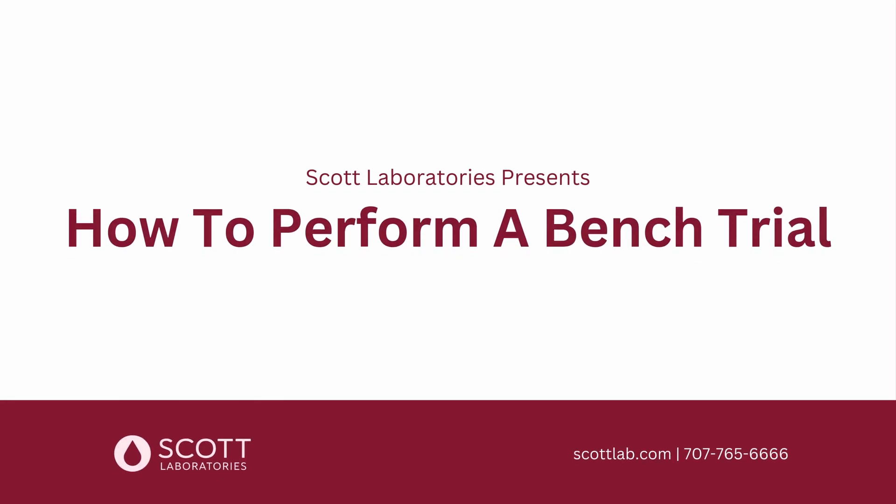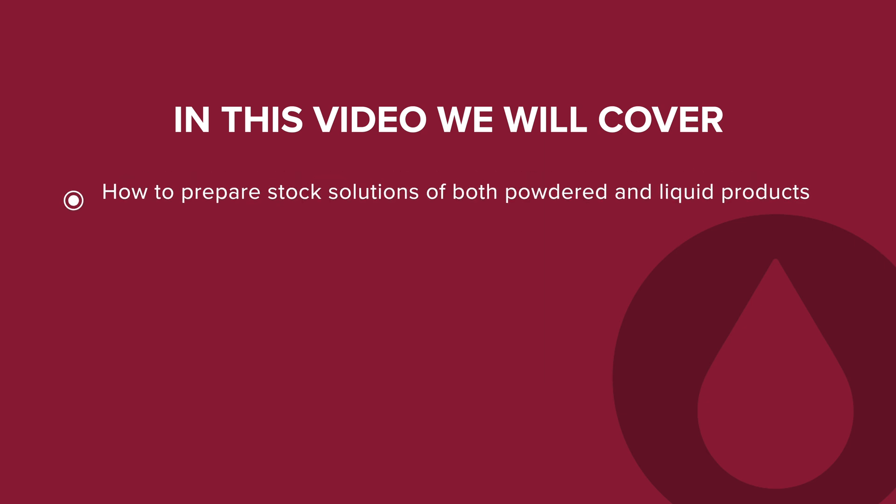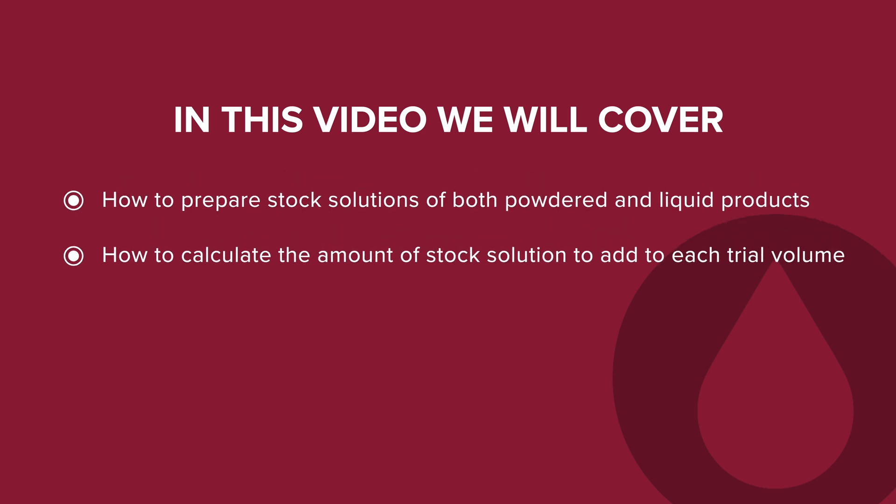How to perform a bench trial with Scott Laboratories. In this video, we will cover how to prepare stock solutions of both powdered and liquid products, how to calculate the amount of stock solution to add to each trial volume, and how to prepare the trial samples.